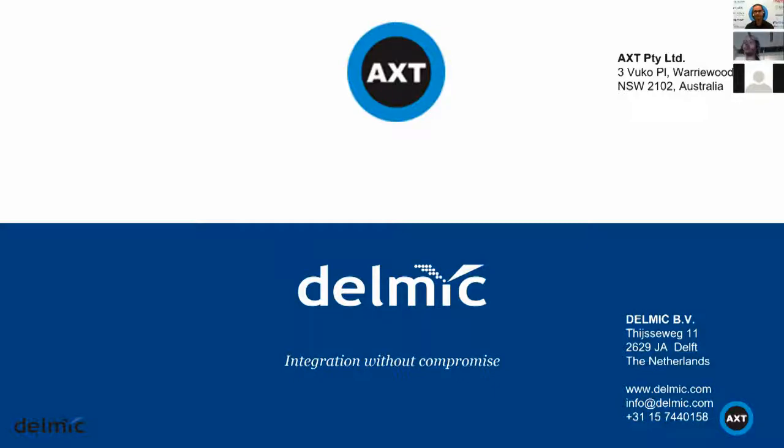Yeah, so that's a very relevant question. It is easy to replace the standard door of the SEM with the SECOM door. It's possible to replace it very quickly, within an hour or so. But of course, it needs some practice, and there are some things to watch out for, which depend on which SEM you're using and physical restrictions that are there. So you have to be careful not to hit the pole piece, or it can take some time to align the door. But these are all procedures that we would explain when we come to install it the first time.